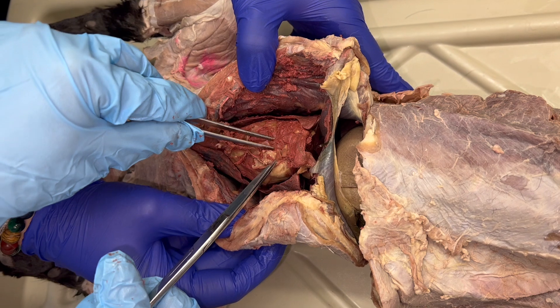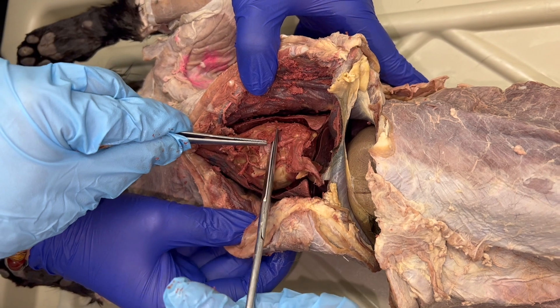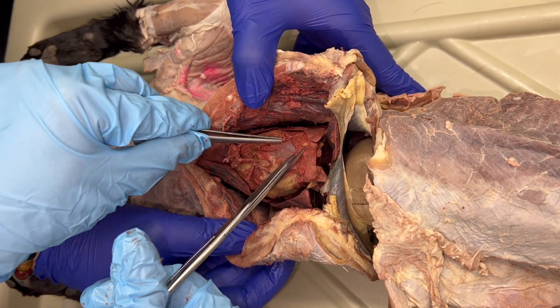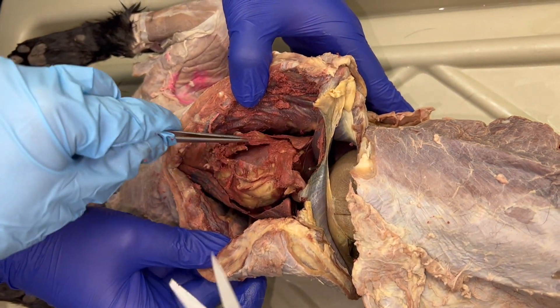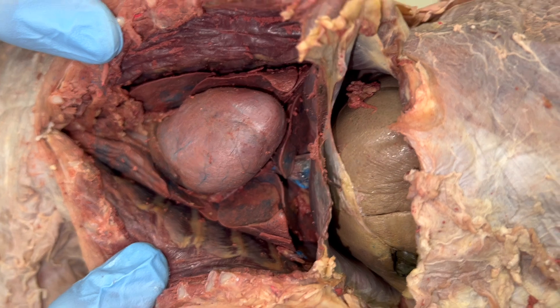You will use scissors and cut through the pericardium and remove it from as much of the heart as you can, especially up at the top of the heart where we're going to be looking for some blood vessels. Still be careful of that mammary vein and artery.